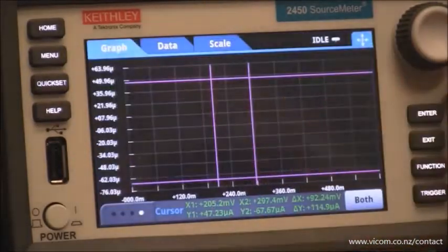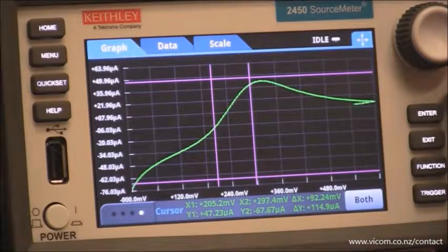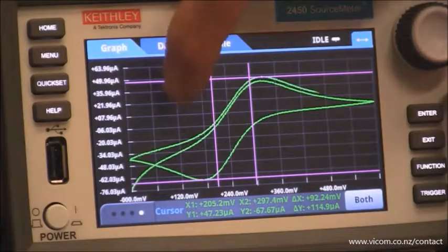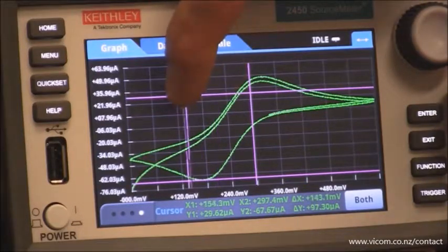And I begin the experiment. You can see the voltammogram running. You can see the first anodic peak. You can see the reduction peak. And at any time during the experiment or after, you can use the cursors and define the peaks or current levels.